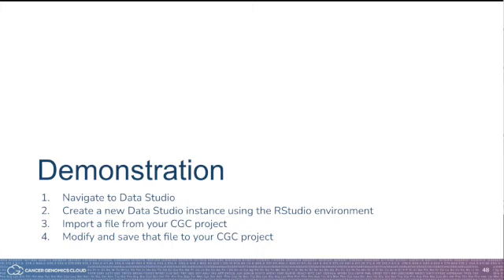For this video, I will demonstrate the following. 1. I'll navigate to Data Studio. 2. Create a new Data Studio instance using the RStudio environment. 3. Import a file from your CGC project. And 4. Modify and save that file to the CGC project.